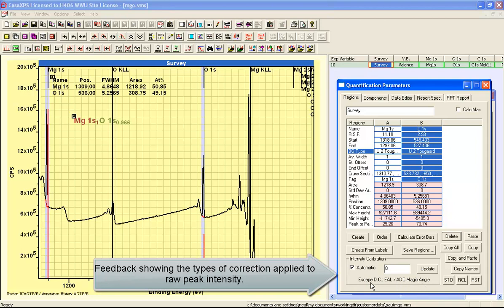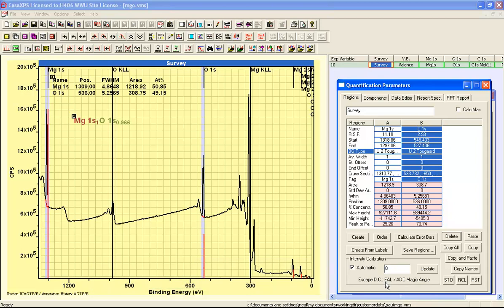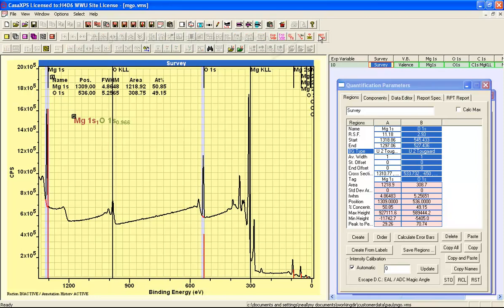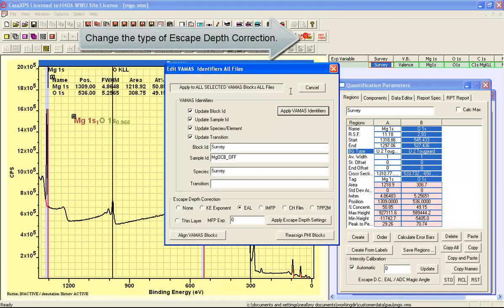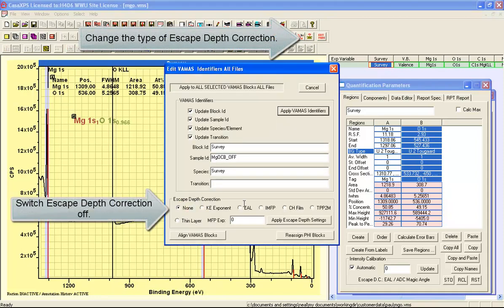And the other correction is the escape depth correction, which is effective attenuation length. And the tick here indicates that we have a transmission function active. So let's now remove these corrections. So I'm first of all going to turn the escape depth correction off.